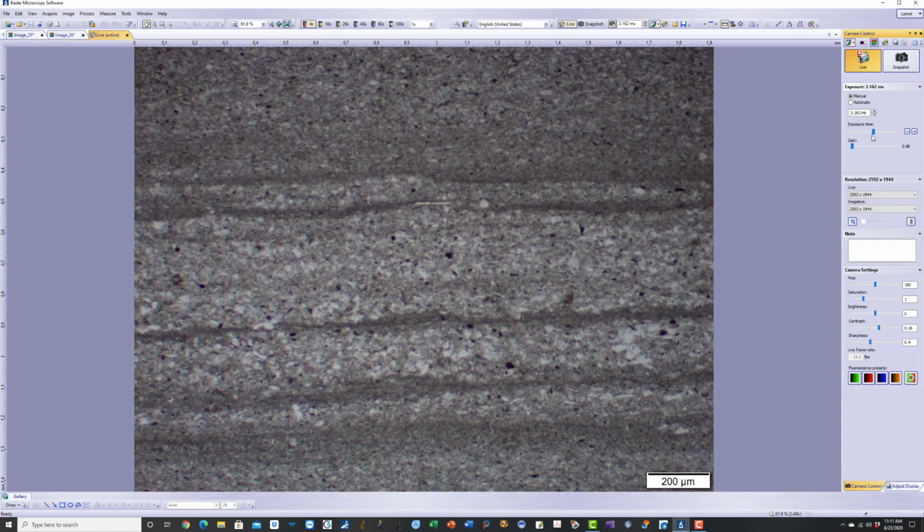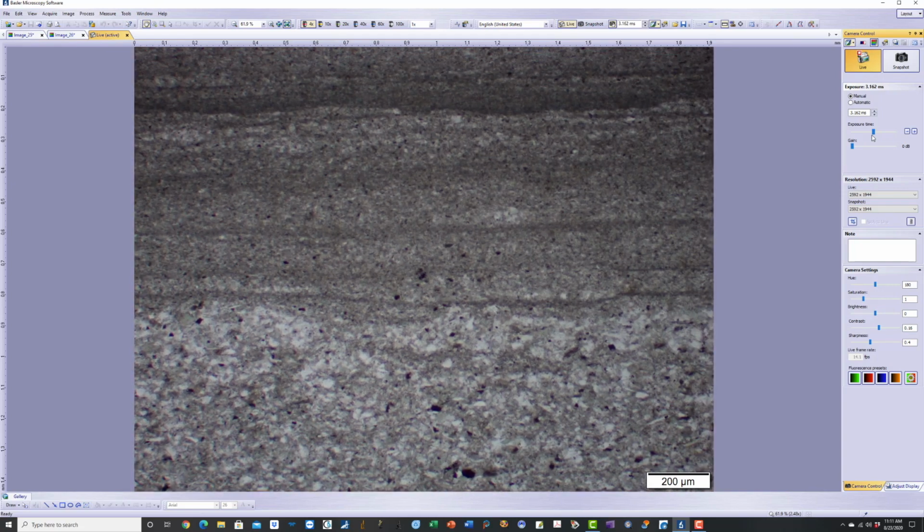That's why it's called flagstone, commonly used in roofs or pavers for its tendency to break down into flat pieces from the slaty cleavage. There are many sandstones with fine bedding planes that are also called flagstone. These are either very fine-grained sandstone with layers or slate with slaty cleavage, which shows this tendency to break the rock into flat pieces. That's why these are known as flagstone.